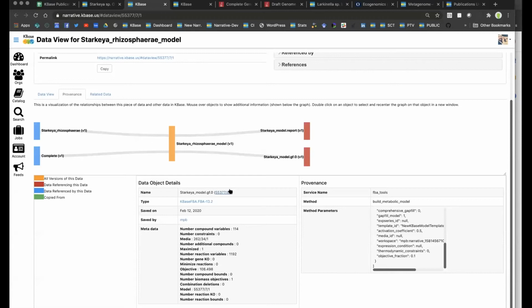KBase, we have a way of coordinating that, and of course our whole project is built around trying to coordinate those things together in sync. And what you're looking at right here is a snapshot of when and what tools were available for this specific process.